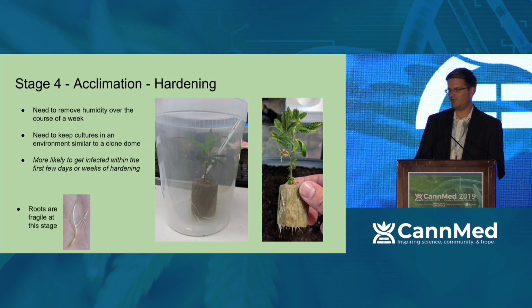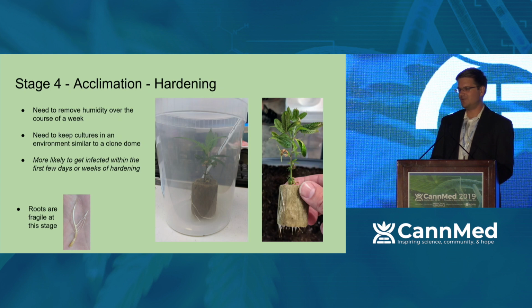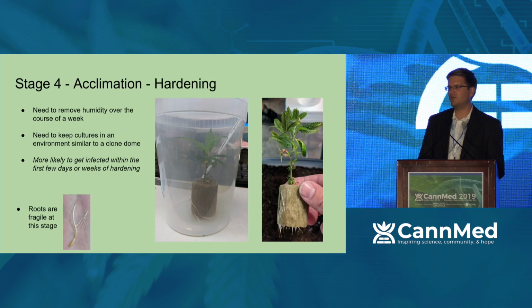Now, I should mention, as I was pulling some of these plants out of culture, the roots would snap off if I accidentally touched them or brushed them against something. So they are extremely fragile at this stage. They've been growing in basically a jello substance the entire time. At that point, you can pull it out, you can wiggle it around, they might not break off, but if you go flicking or tapping them, there's a good chance they will. The plants are not accustomed to that. They haven't developed the resistance in the structure to really be able to move around that much.